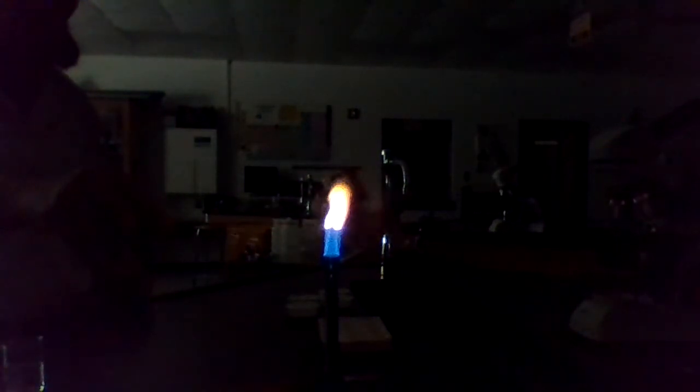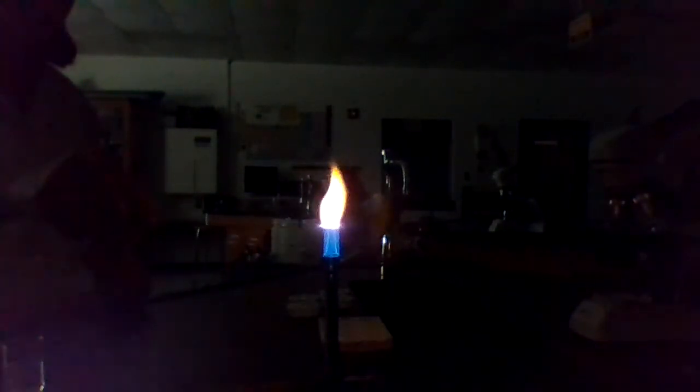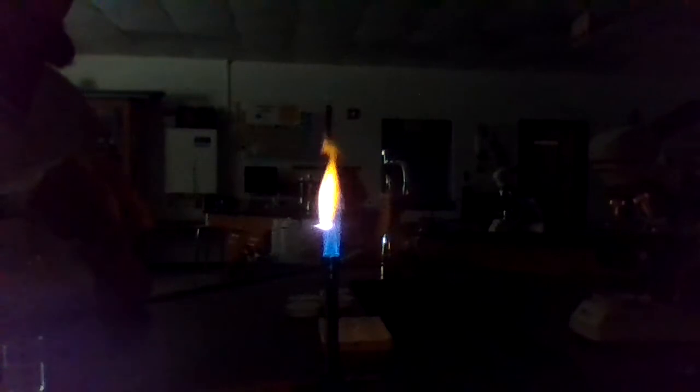You can kind of see it in that. Yeah, it's still burning purple. That's why I actually use new ones every time, because there still seems to be some residue. That's good. Just let it cool a minute. I was checking because I knew I'd put it. All right, and then that's this one. I put it in the wrong one.